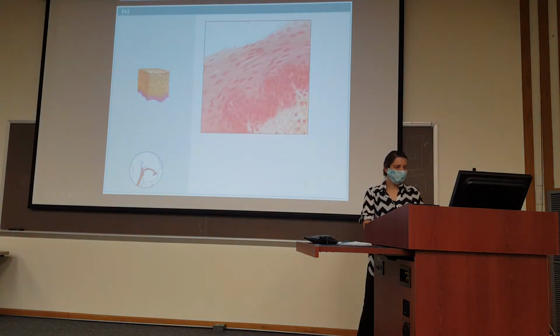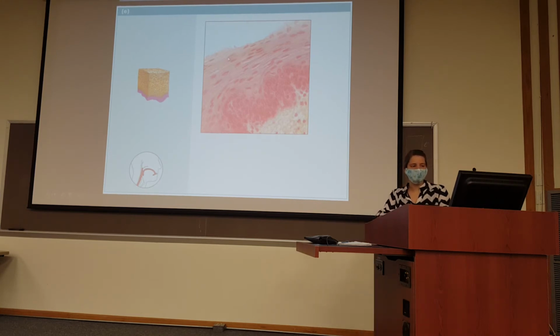All right, so here from, say, your mouth, as you start swallowing, there's the epithelial tissue. You can see it here, lots of layers, right? It's regenerating from under here, and then as layers get sloughed off, new layers come through. Connective tissue support. How would you name this kind?